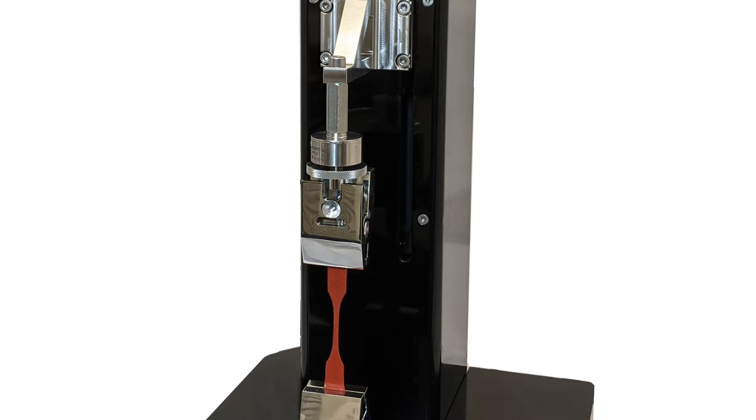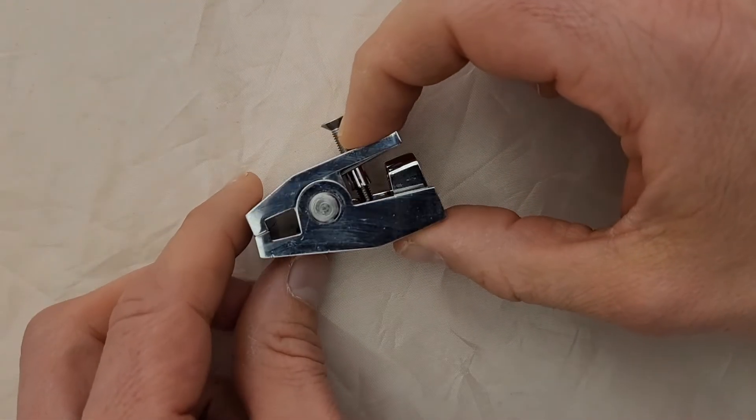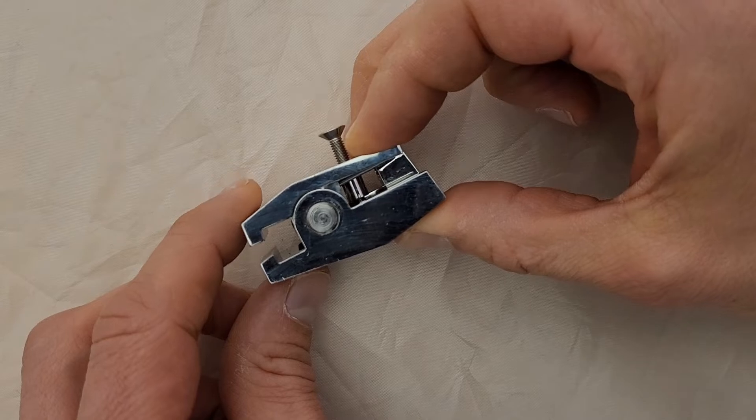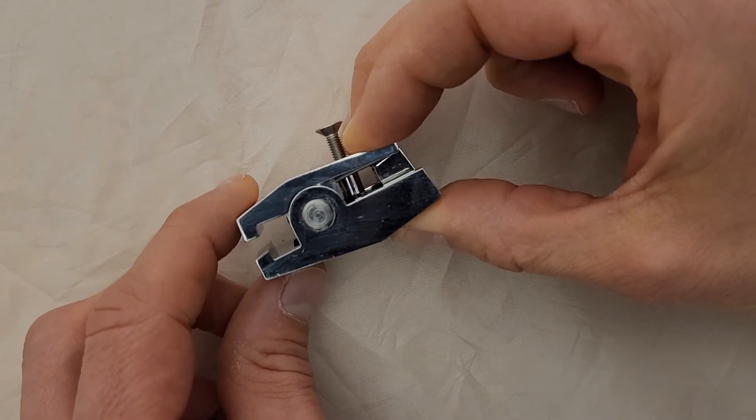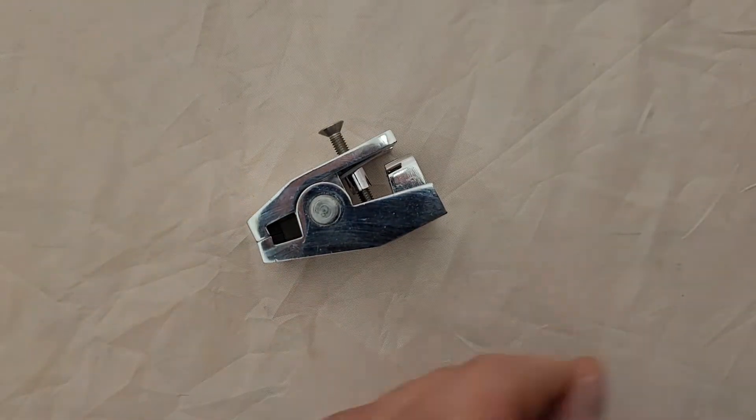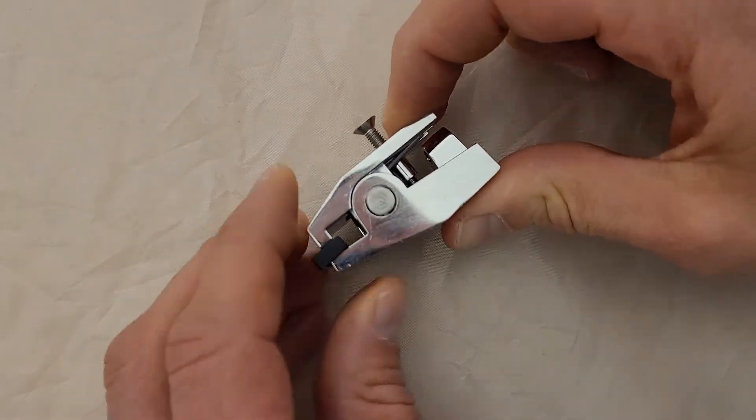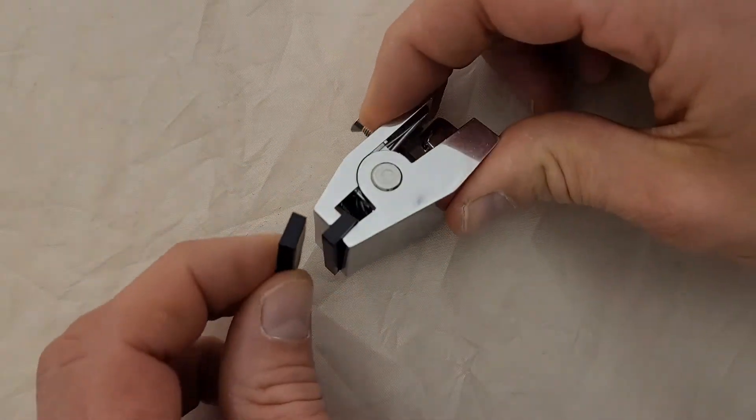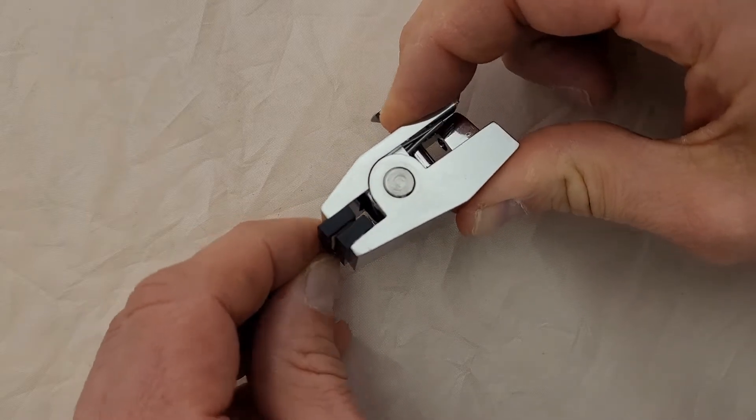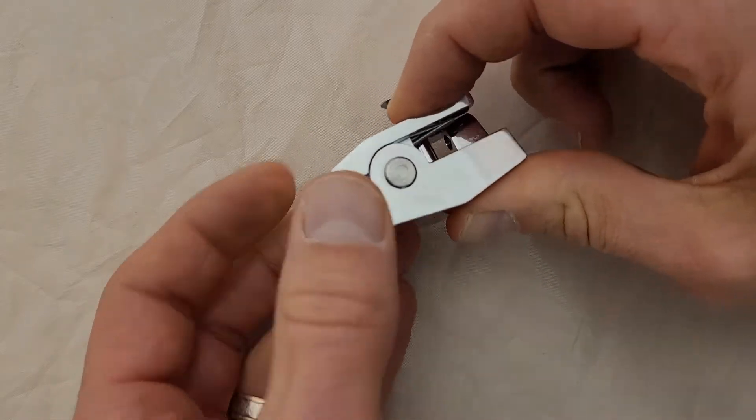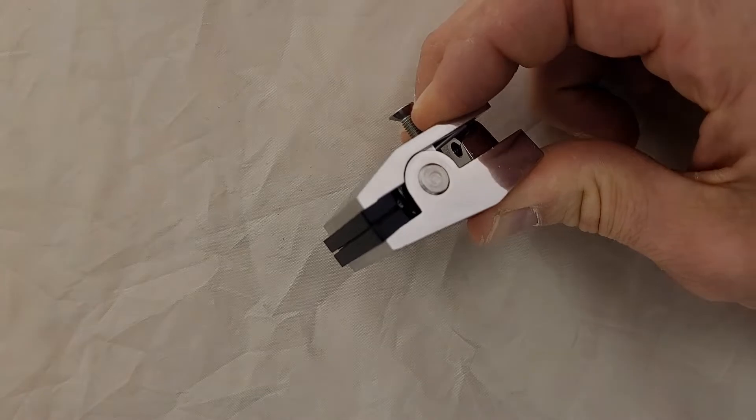These are specially designed grips that have a spring tension feature so you can exchange the spring to get the appropriate clamp force for your specimen so you're not going to damage it but you're holding it with enough force to secure it. They also have a screw closure mechanism for higher force clamping and removable grip covers for a variety of clamping surfaces on soft and slippery biomaterials.